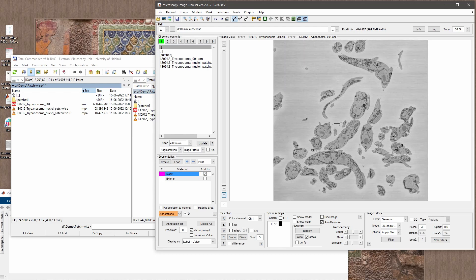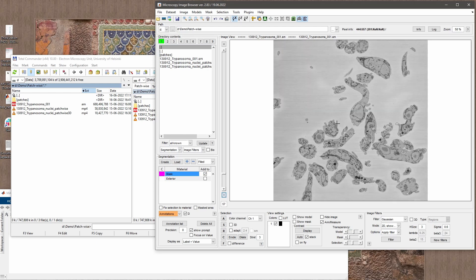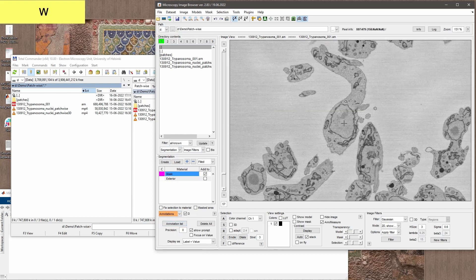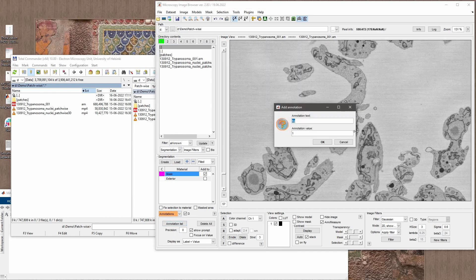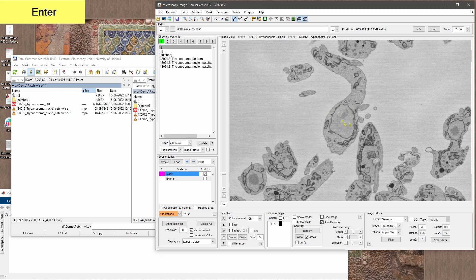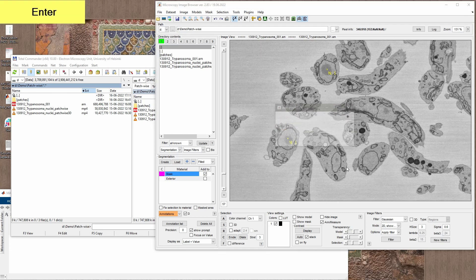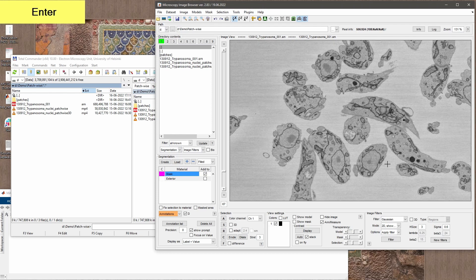We already preloaded a dataset. Now we just need to click inside each of our objects to identify them. To do the clicking we will use the annotation tool in MIB. I select Annotations, zoom in to the nucleus of interest, name the label 'N' for nucleus, and then click inside the nuclei that I see on my images.